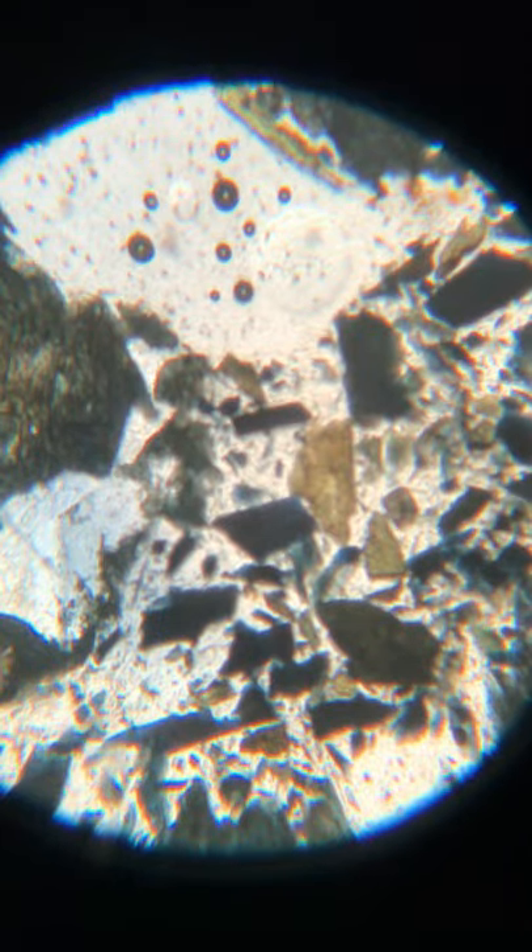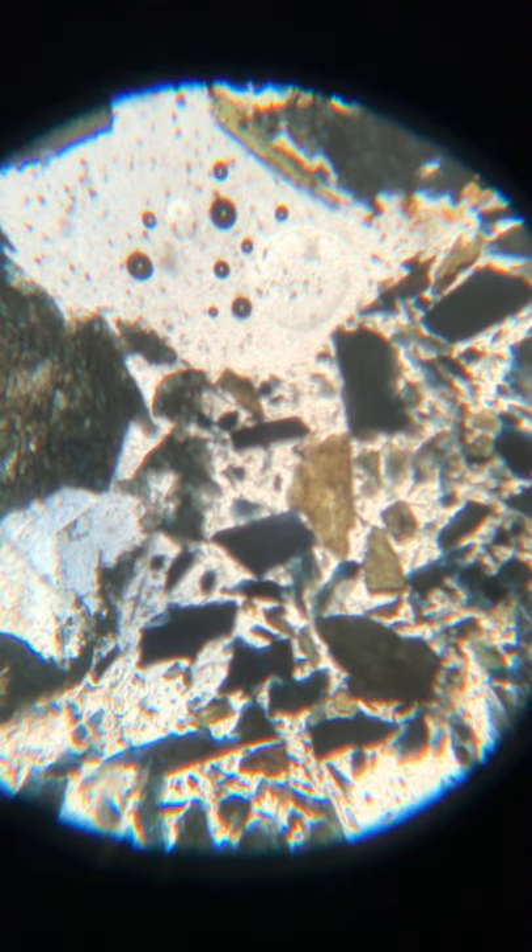This is a thick section showing riebeckite — R-I-E-B-E-C-K-I-T-E — and this is in plain polarized light.